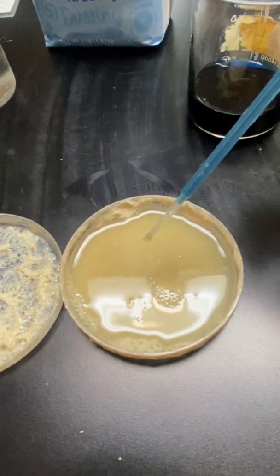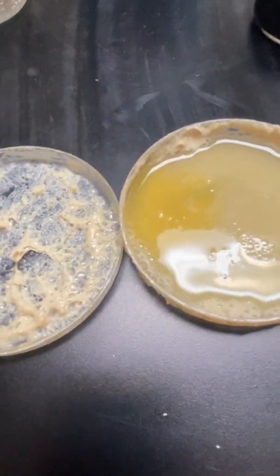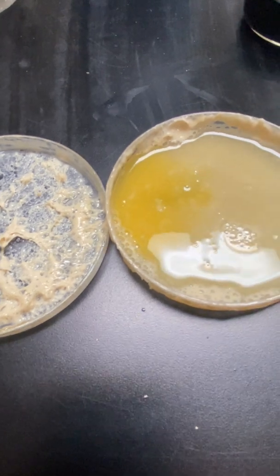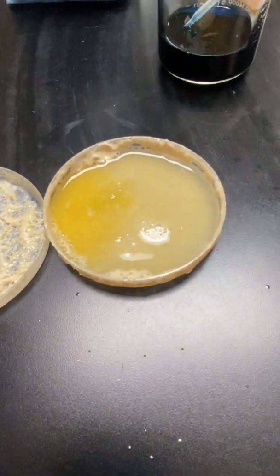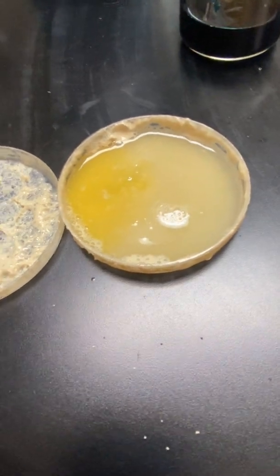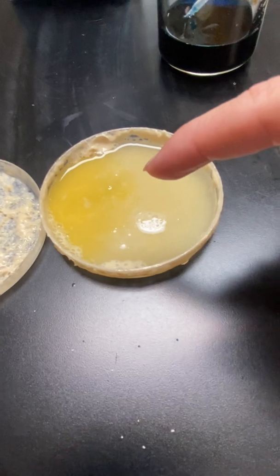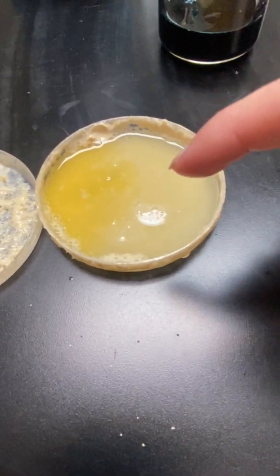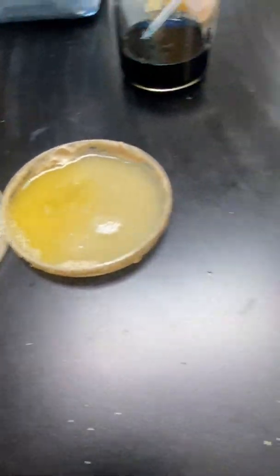So I'm going to add it in here and see what happens. That turned yellow, right? So record that observation. That turned yellow. So what does that mean? Well, it means that that liquid is acidic, so less than 6 on the pH scale, and that means that CO2 was produced in that liquid to make it acidic. Okay, so for the next part, that was number 6.